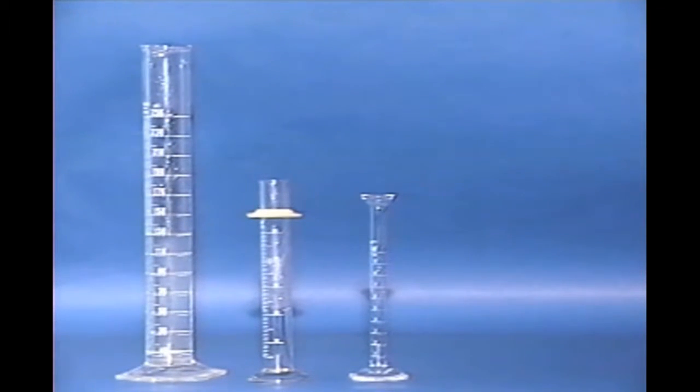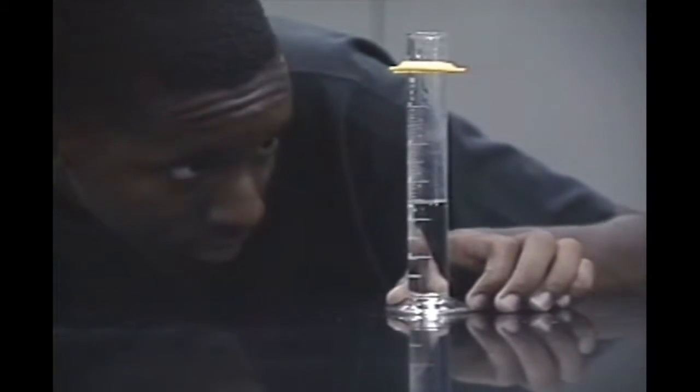Which would be the most exact? If you look closely, you will see that the smallest graduate is marked off with the most exact markings. When reading a graduated cylinder, care has to be taken as the fluid you are measuring is curved inside the cylinder.